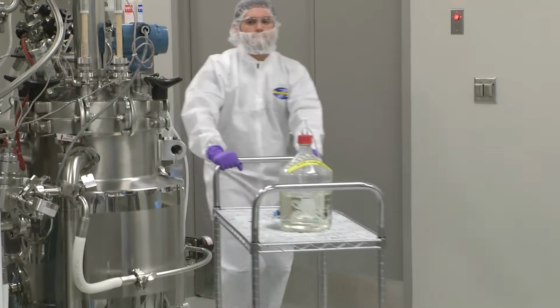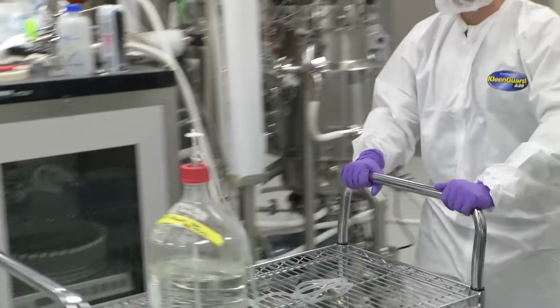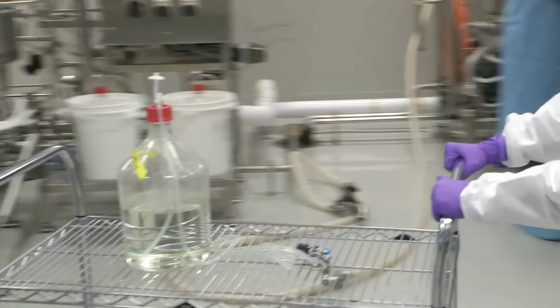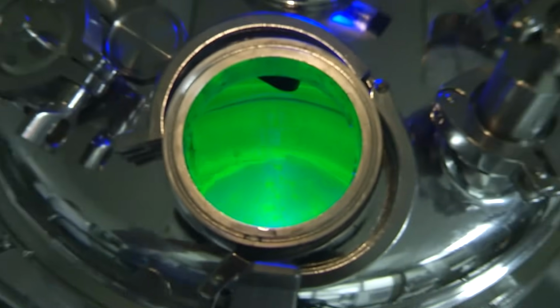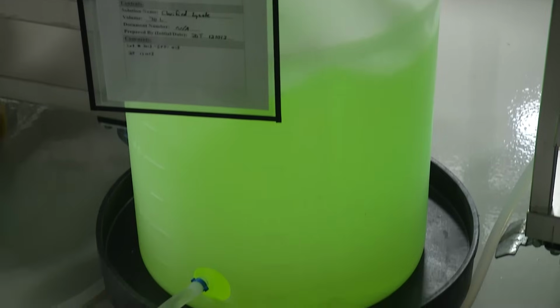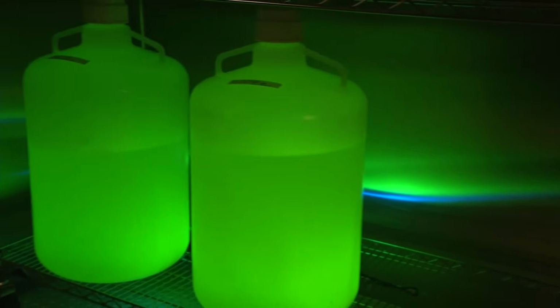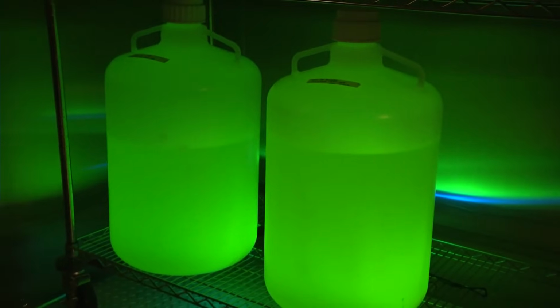Now that we have a basic understanding of how fermentation works, let's look at an actual process and see how it all comes together. For our sample process, we will look at the production of green fluorescent protein, or GFP. GFP is broadly used as a biological marker. It's a fluorescent dye that's very well tolerated by most cells and doesn't interfere with normal cellular function.